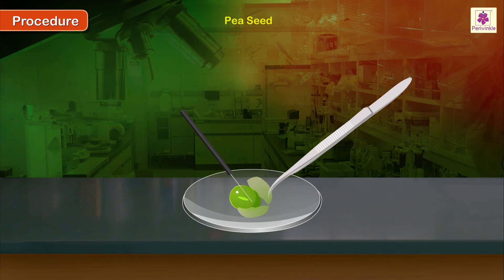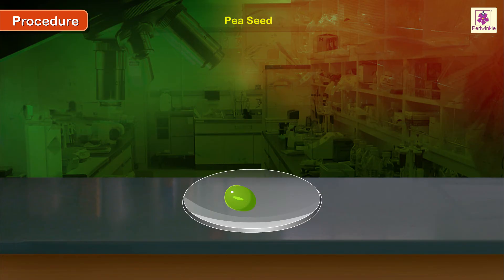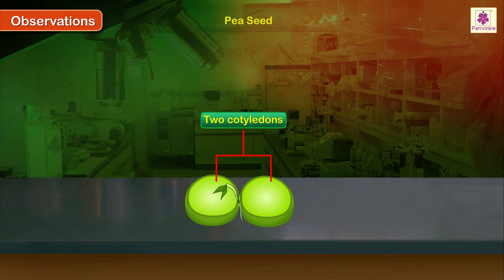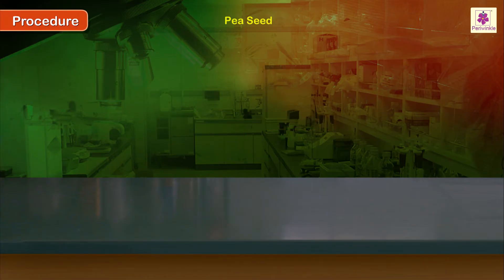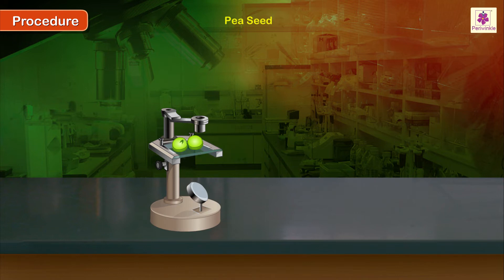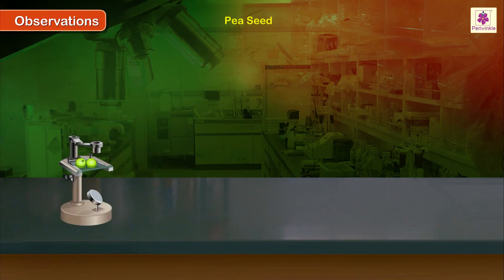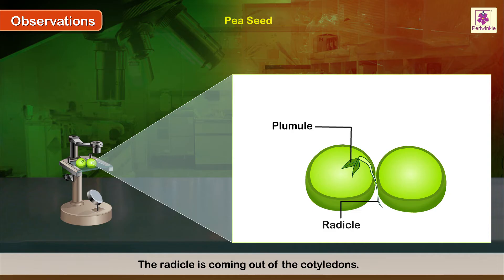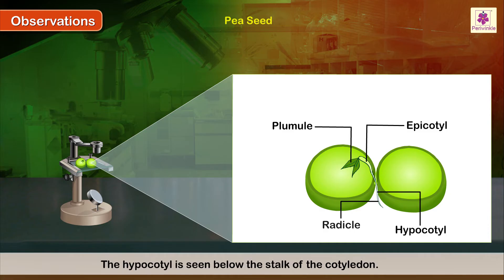Separate the two cotyledons of the seed using the needle. Observations: it has two cotyledons; the cotyledons are thick and fleshy. Observe the seed through the microscope and note your observations. The plumule is enclosed between the two cotyledons. The radicle is coming out of the cotyledons. The epicotyl can be seen above the root and the hypocotyl below the stalk of the cotyledon.